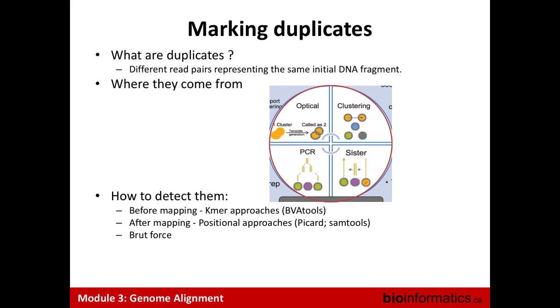So in that case, a big cluster could be split into two clusters, and you can generate two sequences of the same initial read. In the new patterned flow cells, all the clusters are predefined, but if some cluster positions are empty, one molecule could jump from one cluster to the other. So that can make a different cluster.